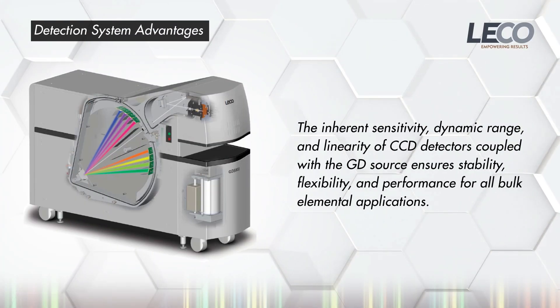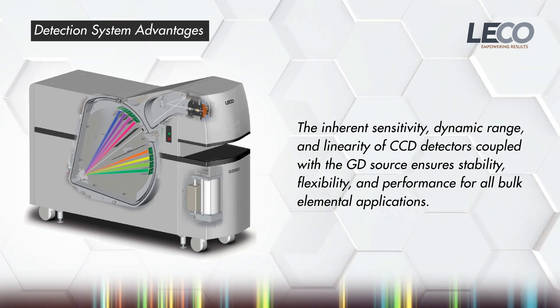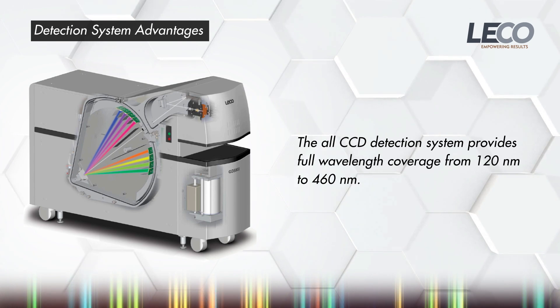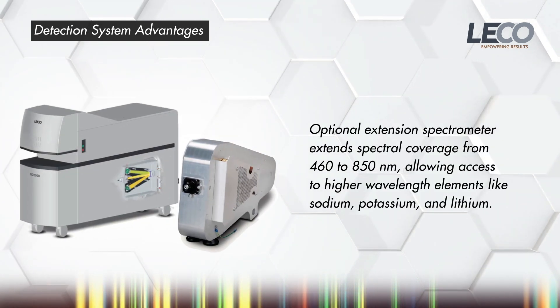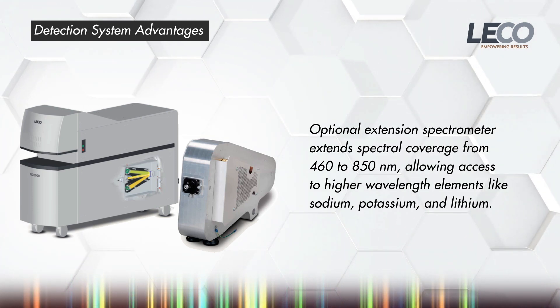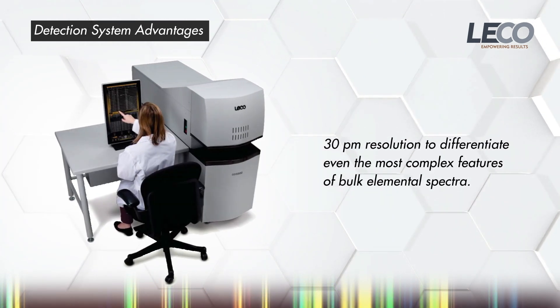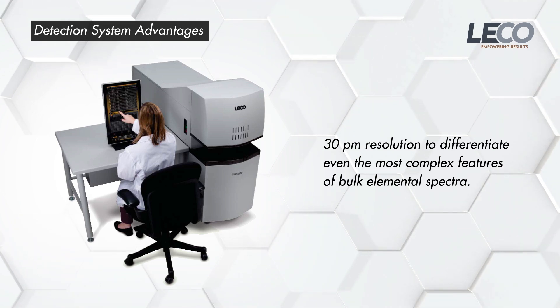The GDS series uses photosensitive charge-coupled device arrays to record the complete emission spectrum from 120 to 460 nanometers, with an optional extension spectrometer to extend the coverage up to 850 nanometers, allowing access to higher wavelength elements like sodium, potassium, and lithium. With up to 30 picometer resolution, even the most complex features of bulk elemental spectra can be easily differentiated.